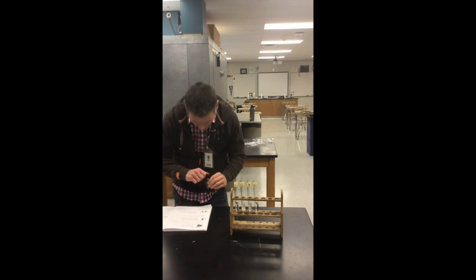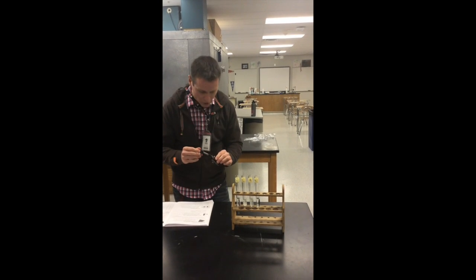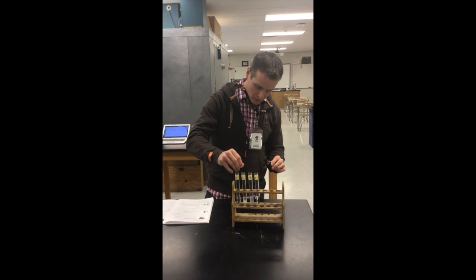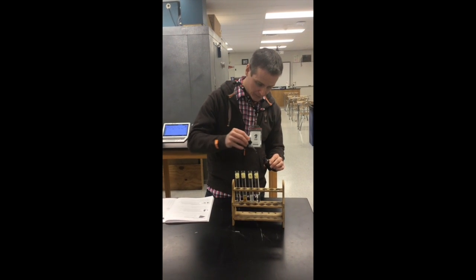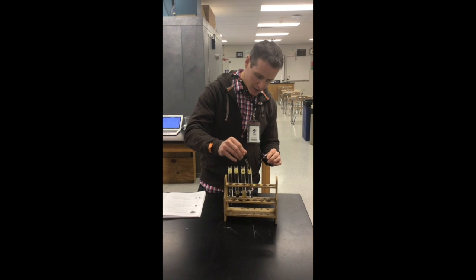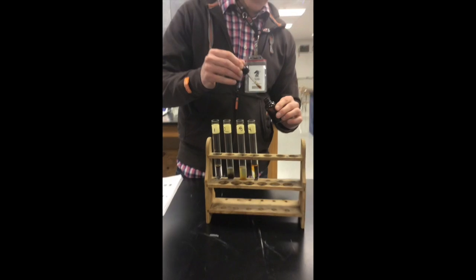So I'm going to go ahead and add in my iodine, and we'll add in 3 drops to each. So to unknown number 1, 2, 3. We'll add in a little bit more there. And then finally 1, 2, 3. All right, so we added in our iodine, and we'll look to see if there's a color change.